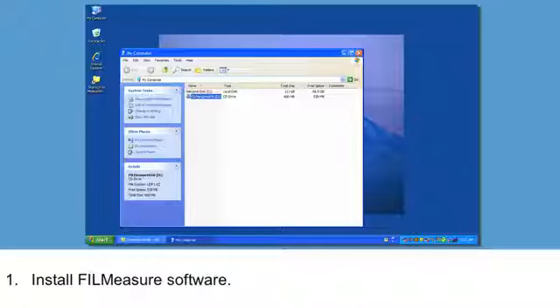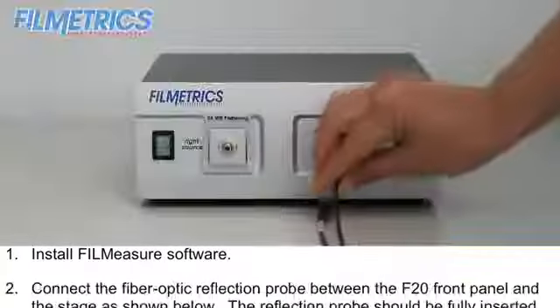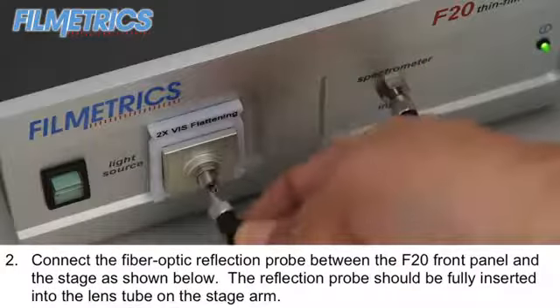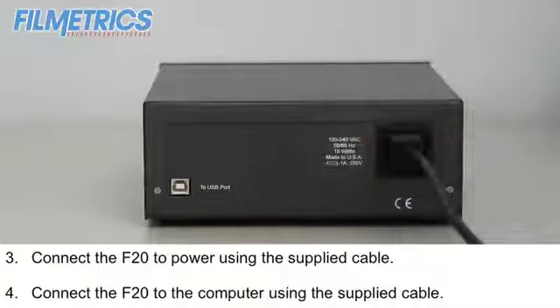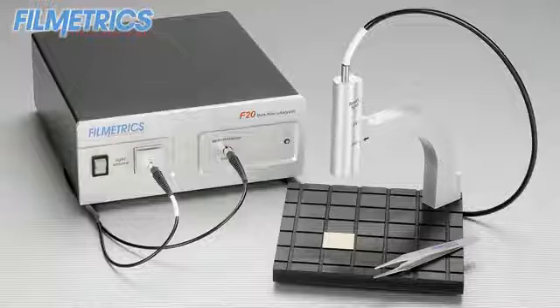Simply install the software, then insert the fiber optic cable into the front panel and stage, and then plug in the power cable. Finally, connect the system to the computer with one USB cable and you're done. Now you're ready to make measurements.